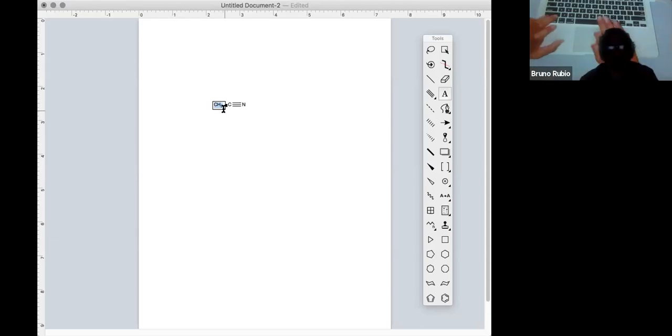So now I would type CH3. I don't want ChemDraw to fix it. I don't want ChemDraw to make it H3C. I want it to go in as CH3. So write CH3 and then click right justified. See, so it didn't fix it.